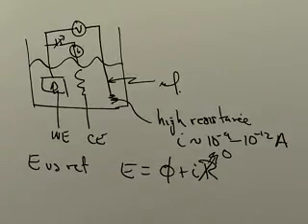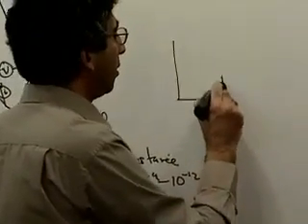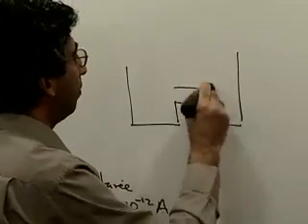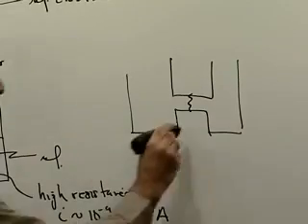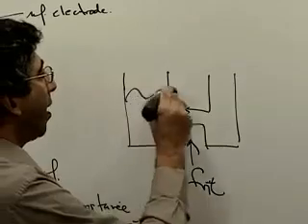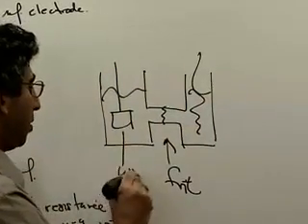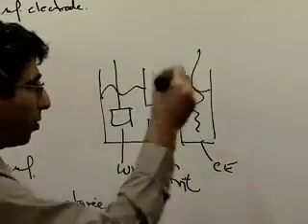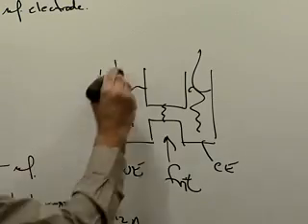But now, here's an important point. What if you go into an experiment and you want to use a classic H cell, a two-compartment cell with a frit in the center? Everybody immediately realizes that I'm going to have the working electrode in one of these compartments and the counter electrode in the other, so I don't reduce what I just oxidized. But the question is, where do I put the reference electrode in this case? And there is a right answer. It's got to be in this compartment right here.